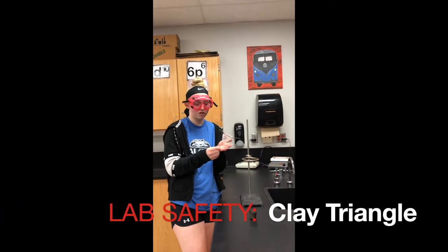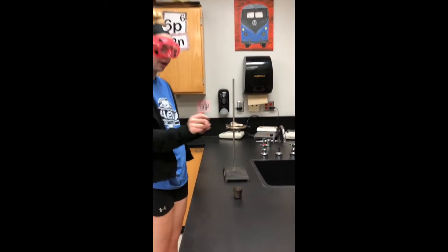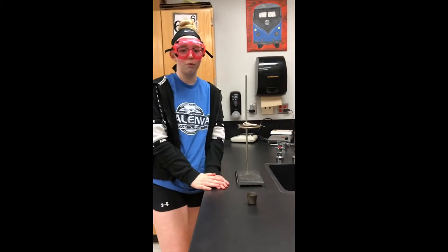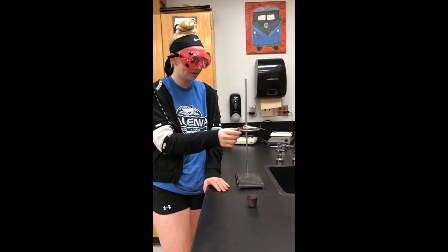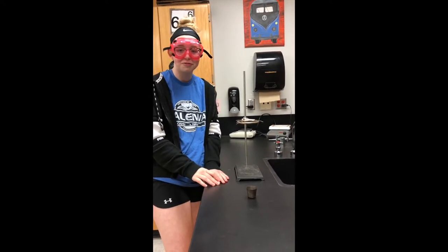This is a clay triangle. You put it on the iron ring stand, and why we use it is so we don't burn our hands trying to heat things over the Bunsen burner flame.